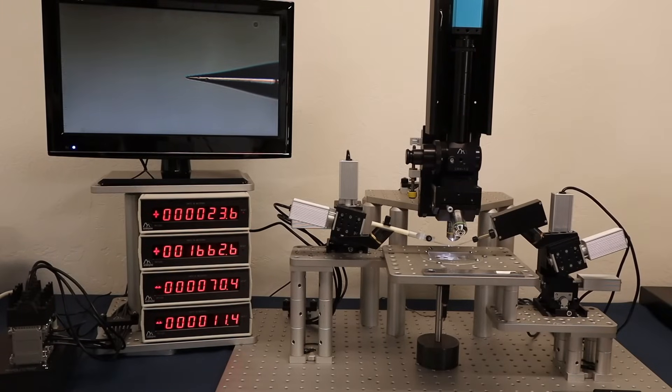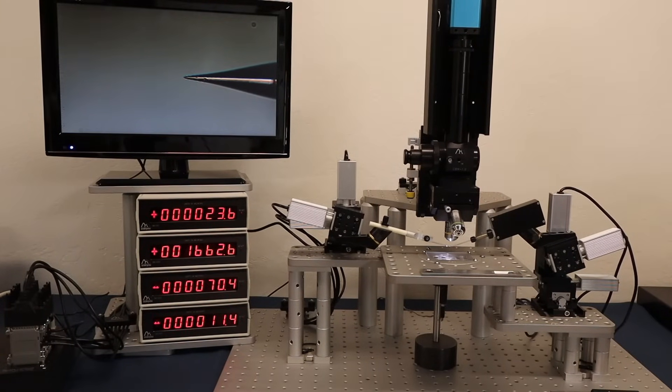In this video, I want to display Sysqu's MX7600 motorized manipulator. The MX7600 is available in right-hand and left-hand configurations. The base provides rotation for alignment and a secure clamping lock for solid mounting.